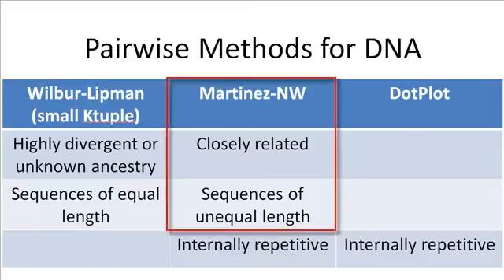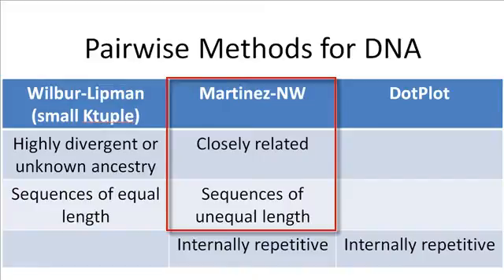In our example here, our sequences are both closely related, being chimpanzee and human, and very different in length. Therefore, the Martinez-Needleman-Wunsch method is definitely the best choice for us.